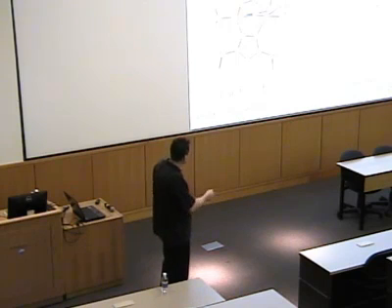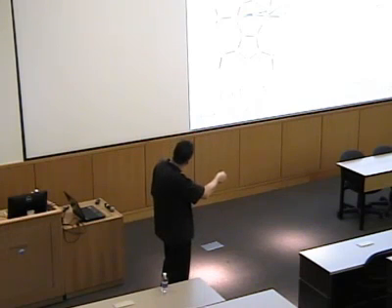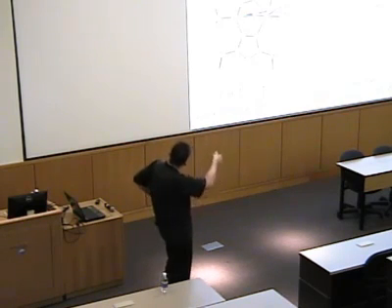We make a very, very concentrated solution. These are actually measured in the solid. And then here you can see that the d-d transitions correspond to this scale in extinction coefficient, and the rest of the spectrum corresponds to this scale. And then you can see here are some transitions, about 500, 1,000, and then it goes up from here. If we go to the pi to pi star transitions of these pyrazole ligands, now your intensity shoots up.